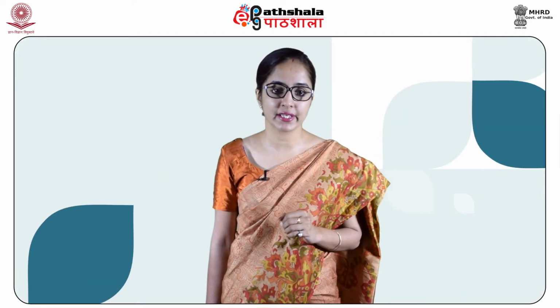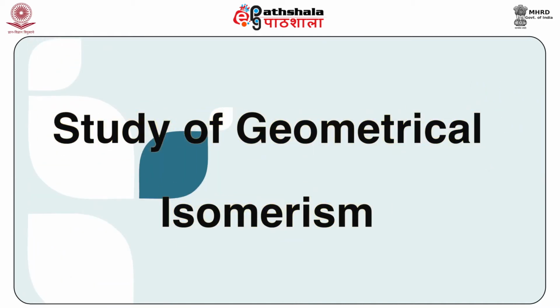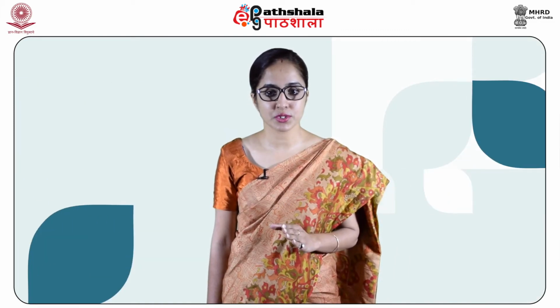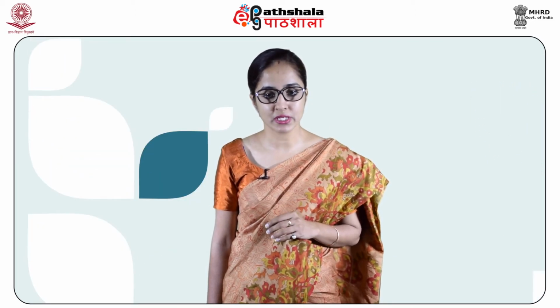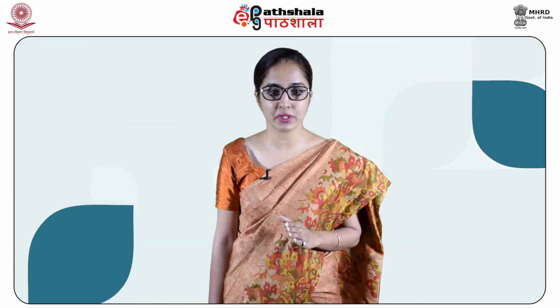Now the next application is the study of geometrical isomerism as an application of IR spectroscopy. As we know, only those vibrations are IR active which cause a change in the dipole moment of the molecule, and the intensity of the absorption depends upon the change in the dipole moment of that molecule.